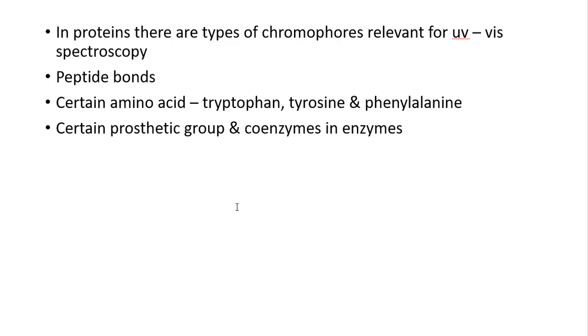Other than that, if you have enzymes with prosthetic groups, like cofactors and coenzymes, the coenzymes are also able to contribute to the UV absorption. The coenzymes are NAD+, FAD+, NADH, and FADH. All these are also able to contribute to the UV absorption.